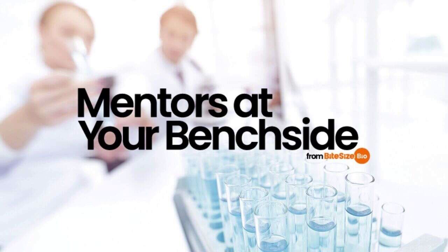Tip 3. Consider the temperature. Another external factor that dramatically impacts the accuracy and stability of analytical balances is temperature. Temperature control is crucial in avoiding the measurement drift phenomenon. This includes maintaining constant temperatures in the environment and for your weighing equipment by carefully avoiding air drafts and nearby cold objects. The best way to ensure temperature stability is to maintain a variation of not more than 2 degrees around the clock. Also, the weighing instrument should always remain on so that its temperature remains constant.